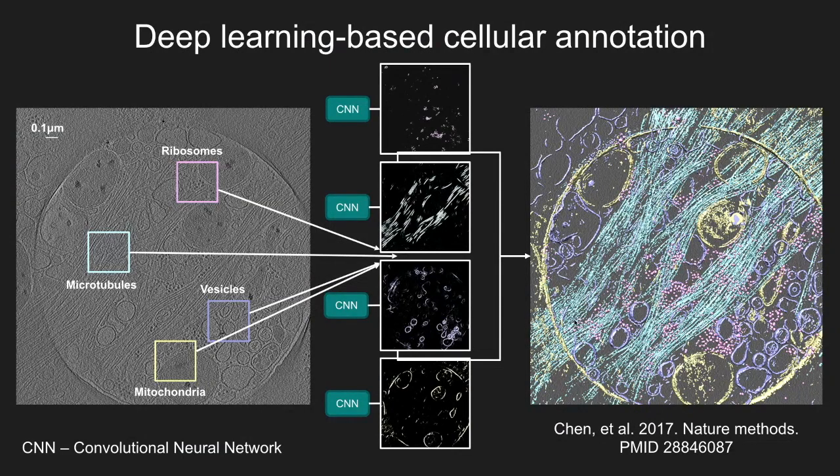Now, in this example, you'll notice that circle there, which seems to be annotated as a mitochondrial membrane. It isn't; it's the edge of the carbon film. I left that in there on purpose. The point is, if you don't train a network to recognize a particular feature, then it will tend to pick out whatever it finds as the most similar thing to that feature.